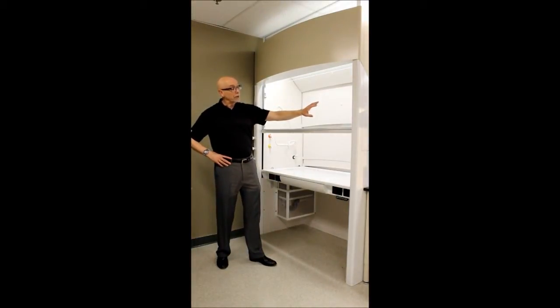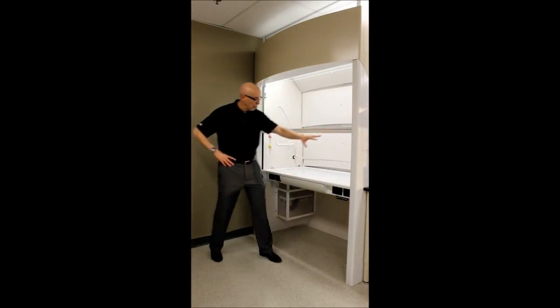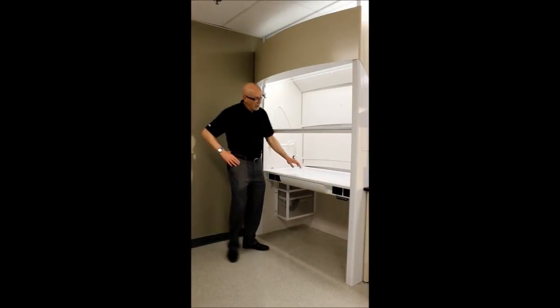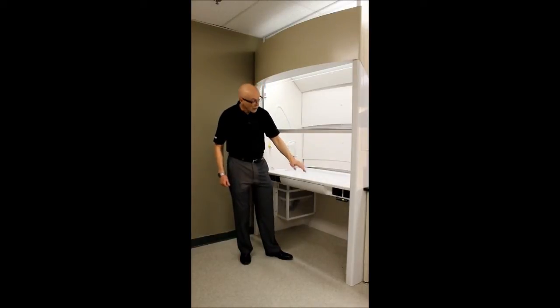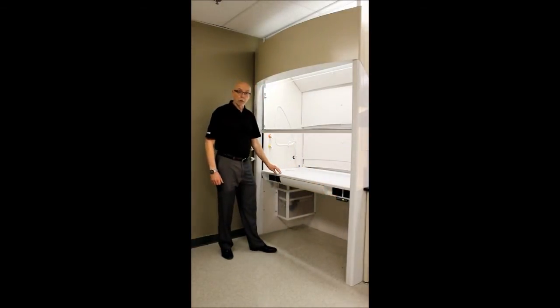Another key attribute of this fume hood is that it's very flexible and very adaptable. You can see that it comes with its own stand-alone frame, and it has a worktop that goes up and down at the push of a button. You can set it infinitely within 30 to 36 inches, and it also has three presets you can utilize if you know the exact height you want it at.